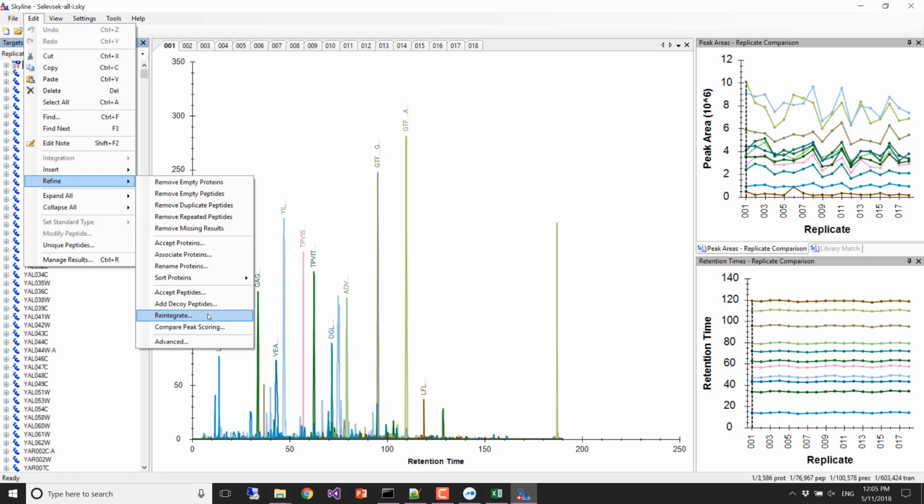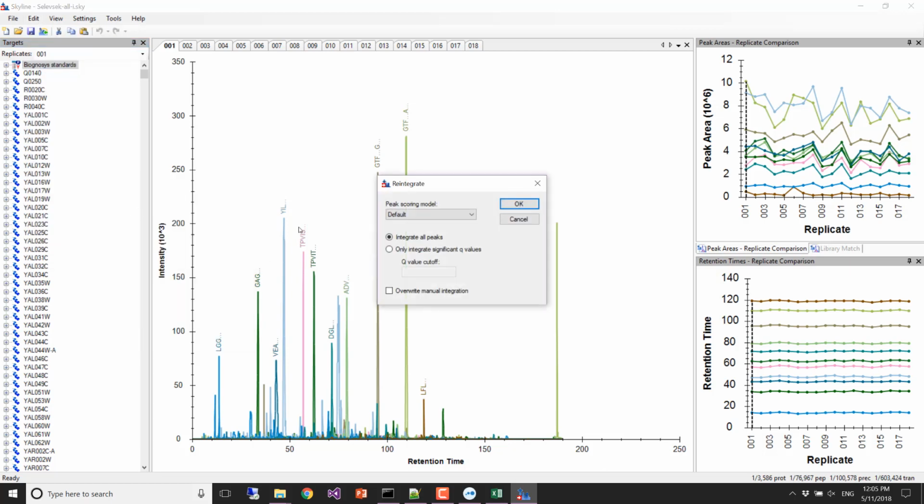Now we're just going to say, oh, we're not doing that refinement step. We want to know what the data looks like if we just did everything the way some people would have us do. So now we're going to add a new training model for this thing.